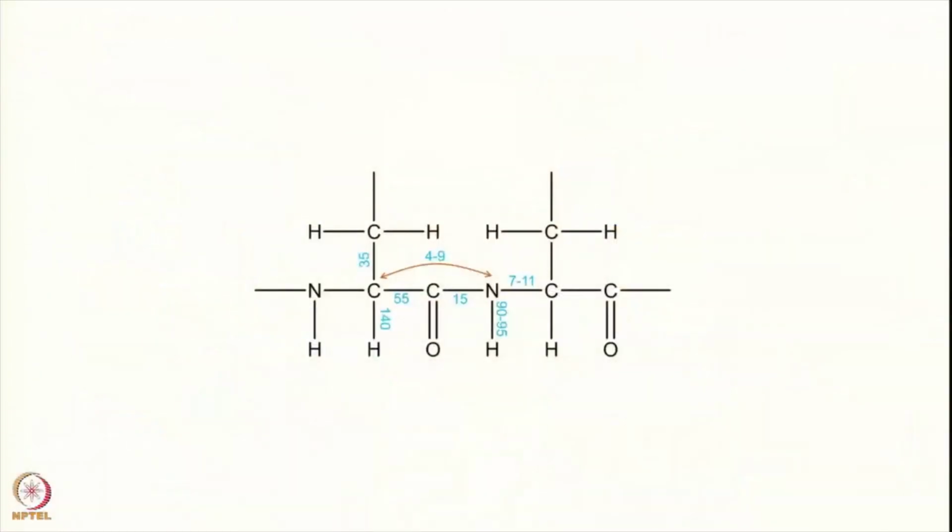Yeah, so you can see that the triple resonance experiments are basically driven by application to proteins.